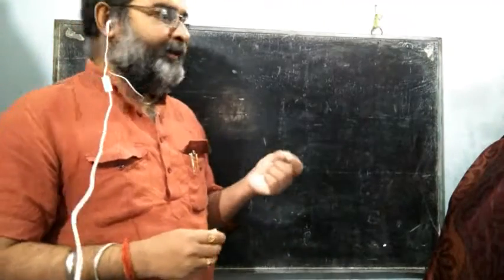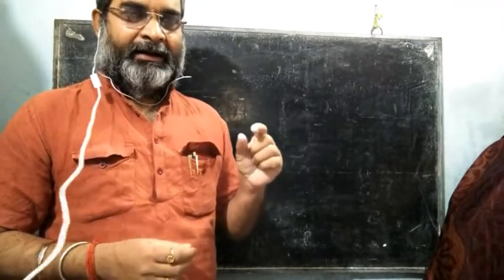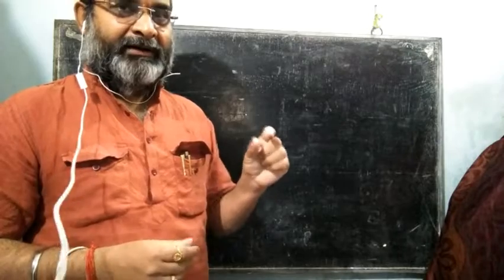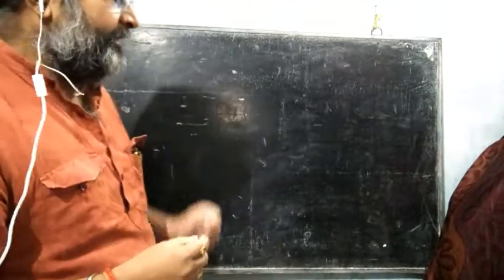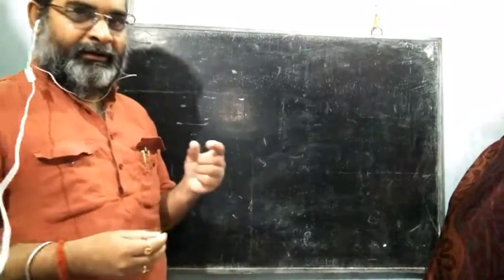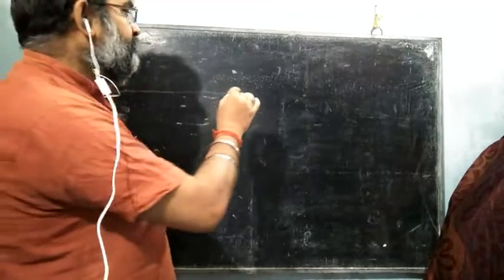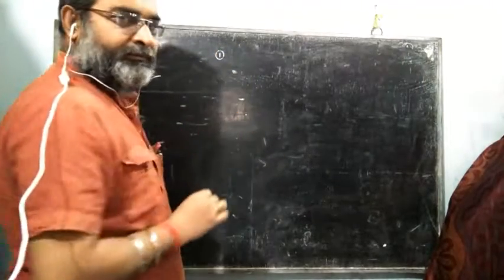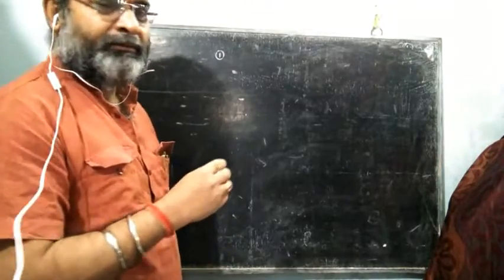So again I am revising only the data analysis part, the analysis of the banding pattern in the last class. In the last class, suppose 4 reactions, I discussed the 4 reactions.